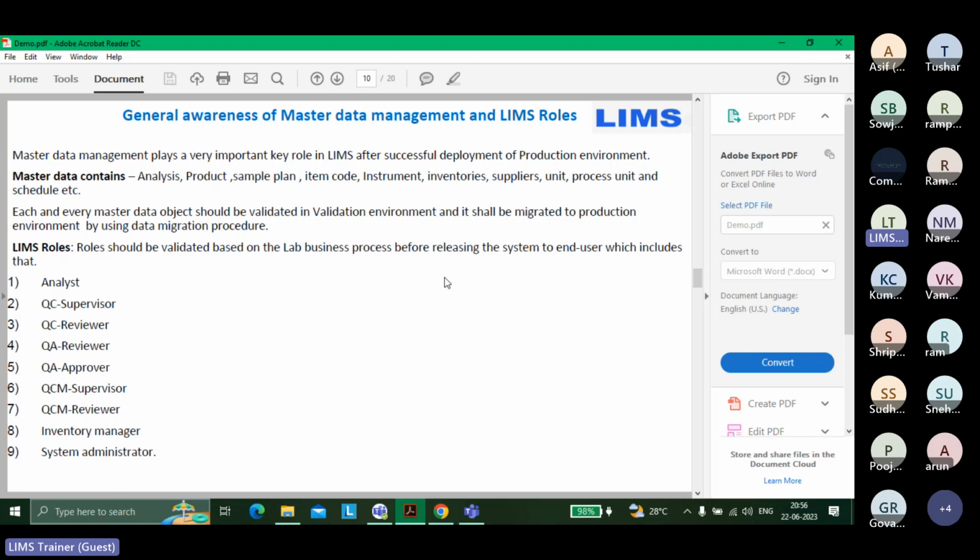And you know how this is done in most LIMS, like this particular role, right? Admin. You will see that admin has all the functions assigned to him. Like, there is one particular function, approve sample. So he can approve sample, reject samples, reject test. A particular LIMS may have 300, 400, 500, I'm not sure, functions. Now, when he's a super user or super admin, he has access to all those functions. He can do all those functions.